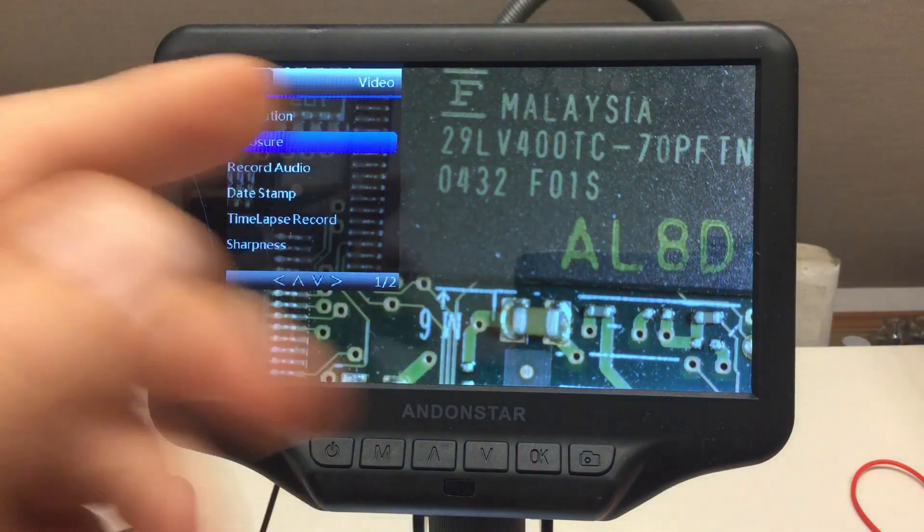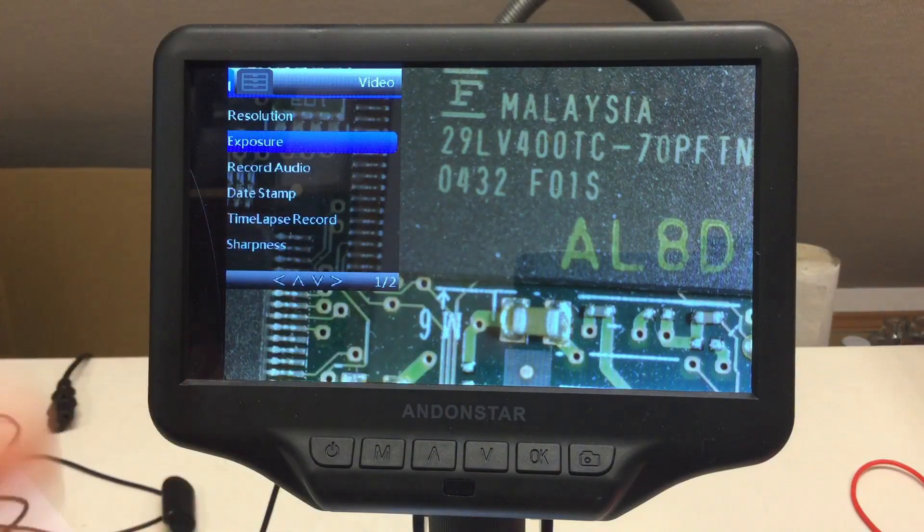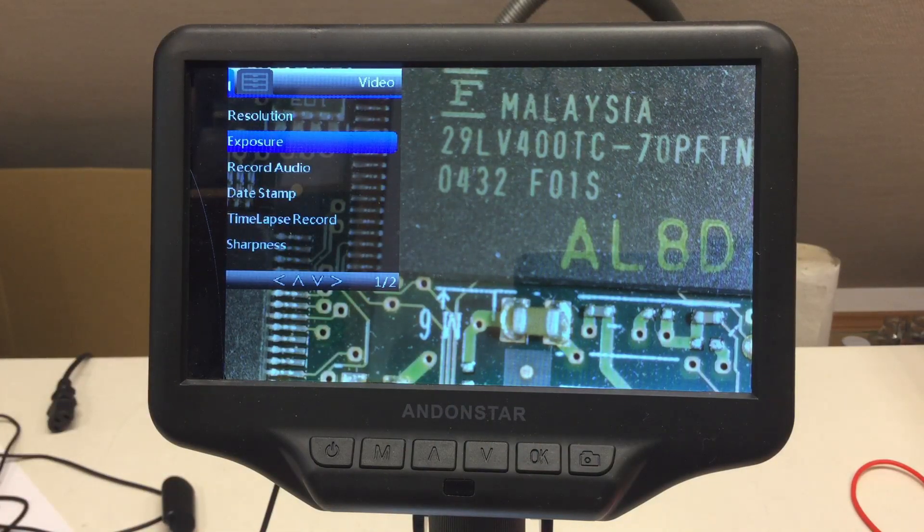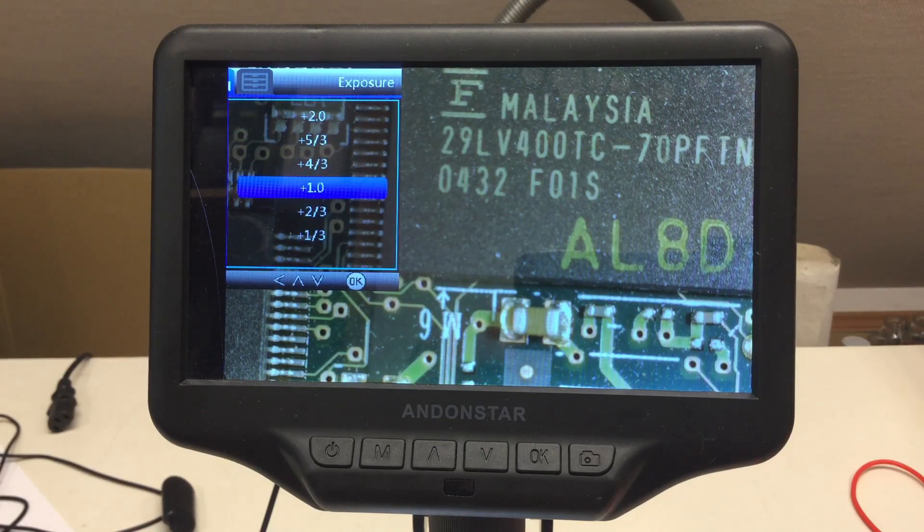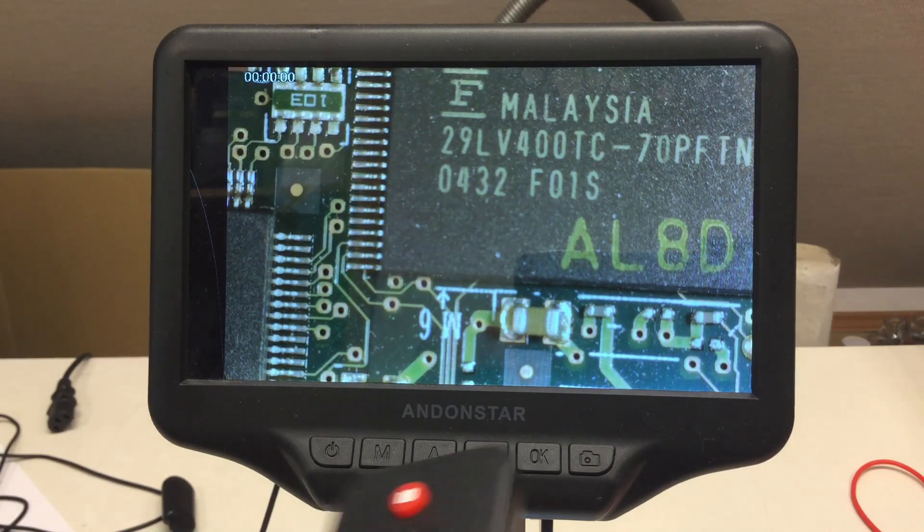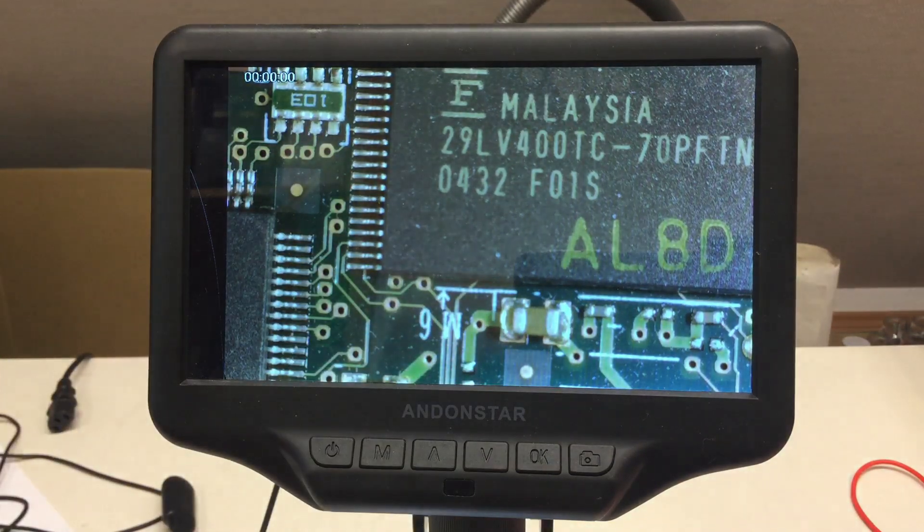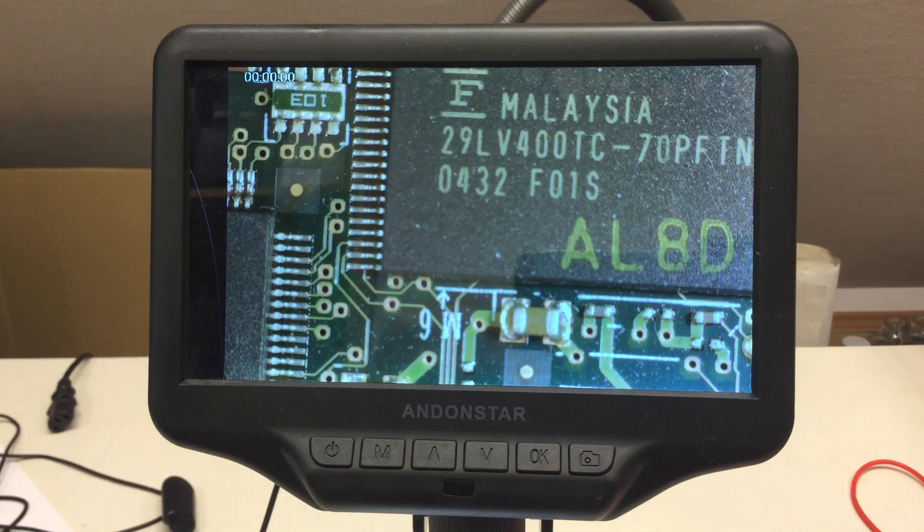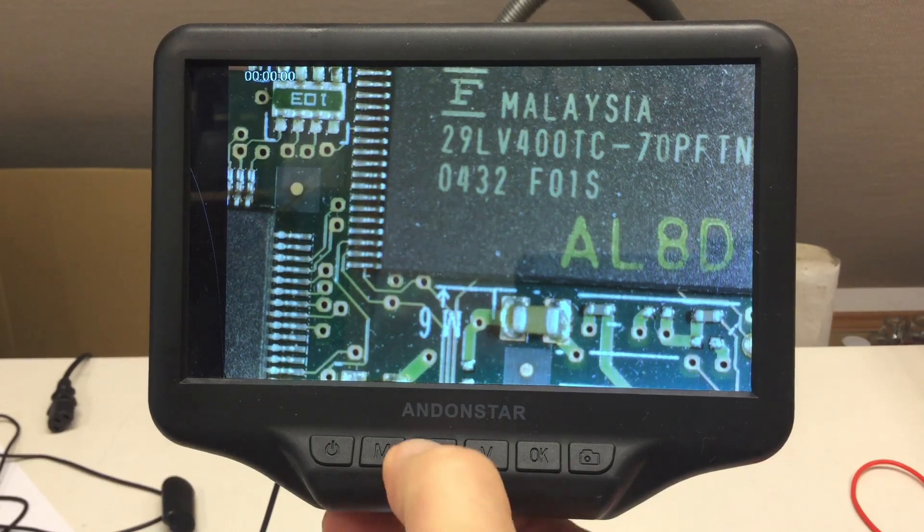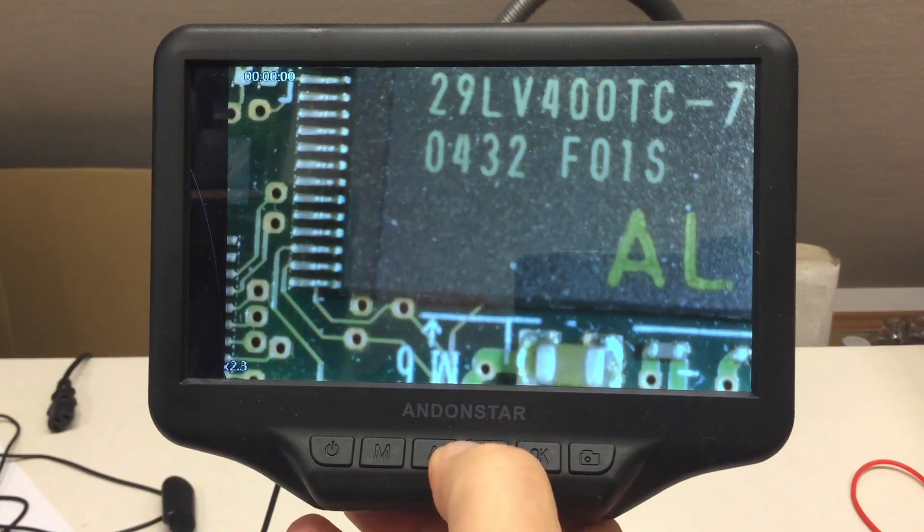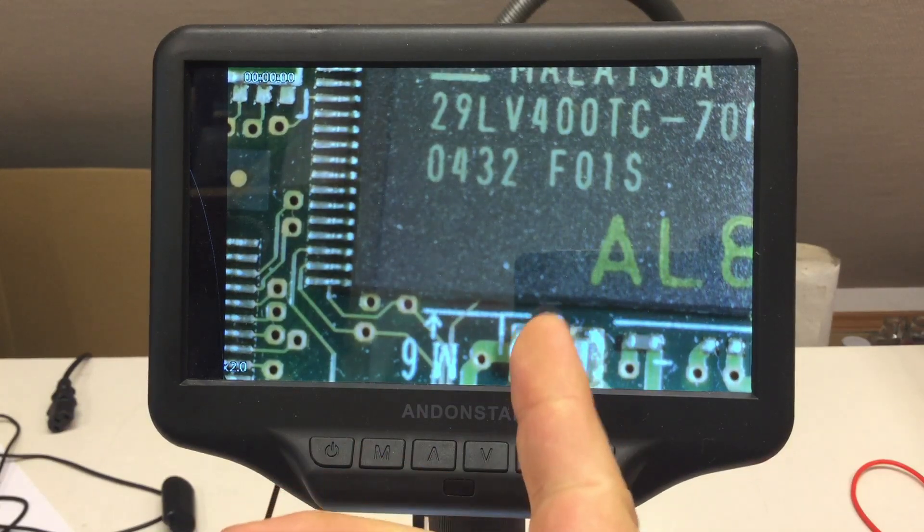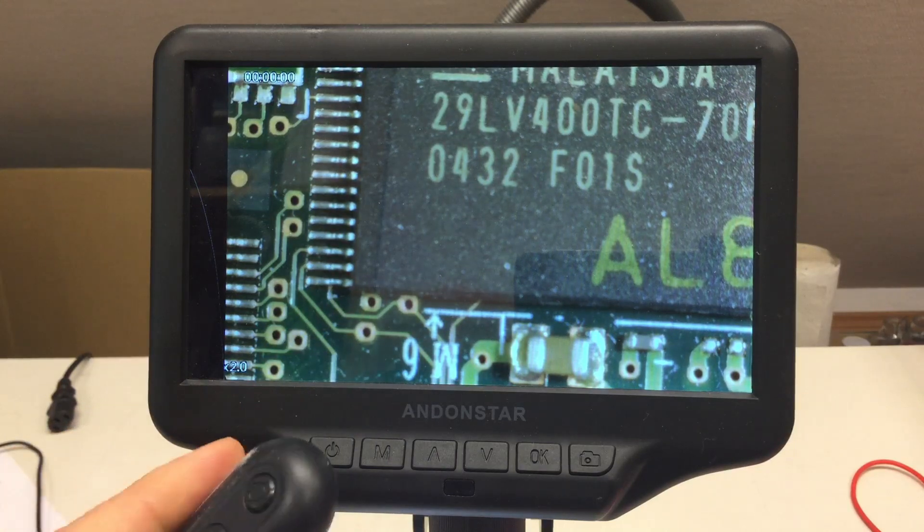You see, it's getting brighter, the picture, because higher exposure, of course. And then let's go out of the menu again. Okay, watch the review again with the remote issues. And now we can maybe zoom in. Ah, I do it this way, to a factor of two. Okay, and now I can cycle the power.